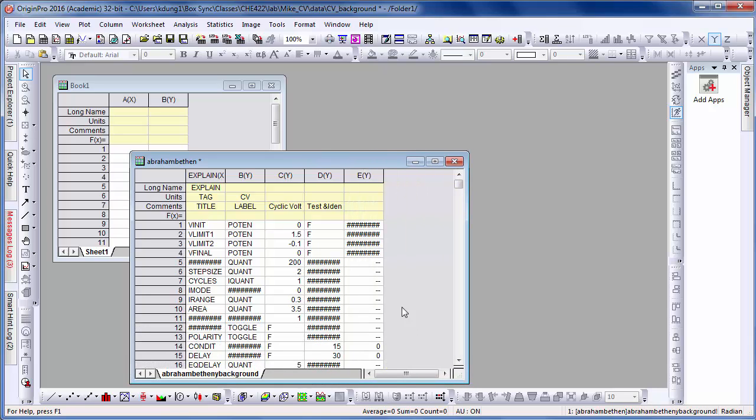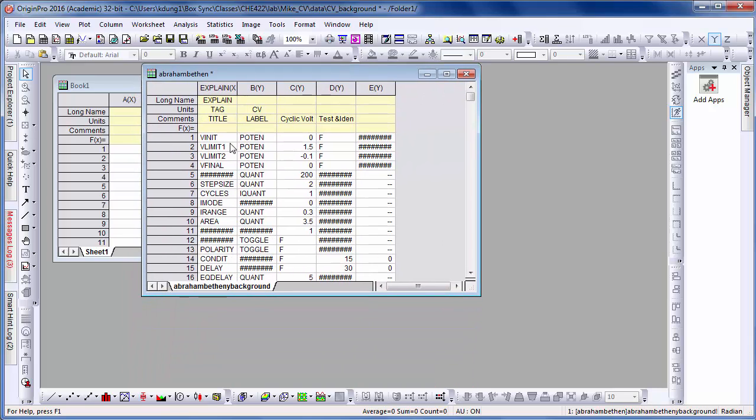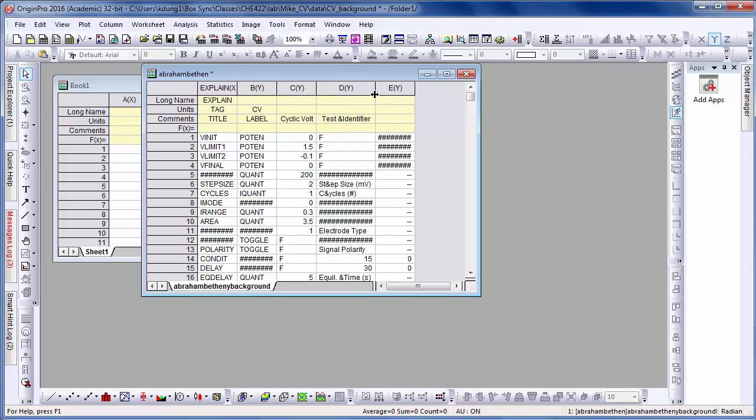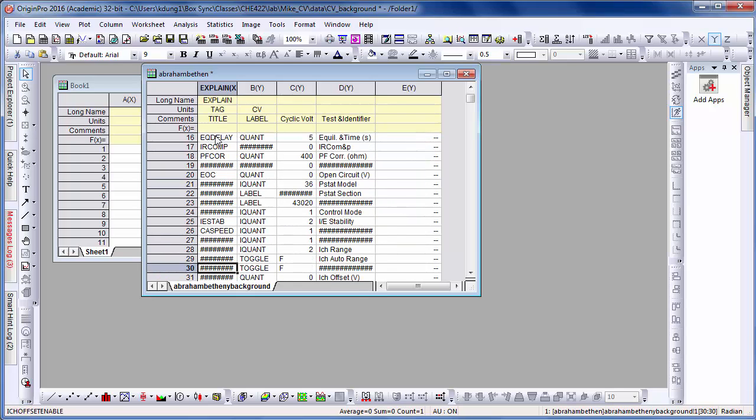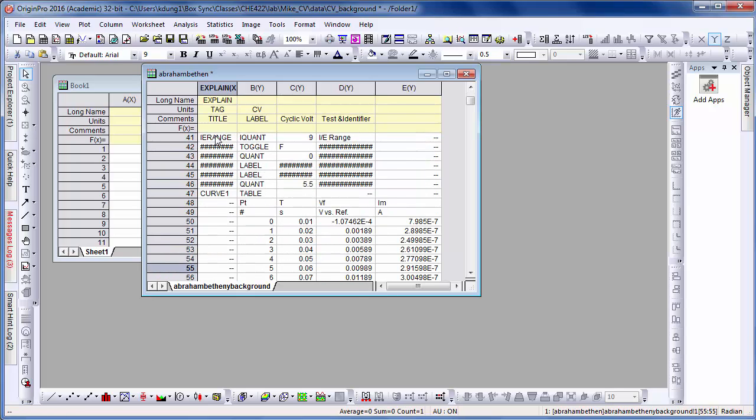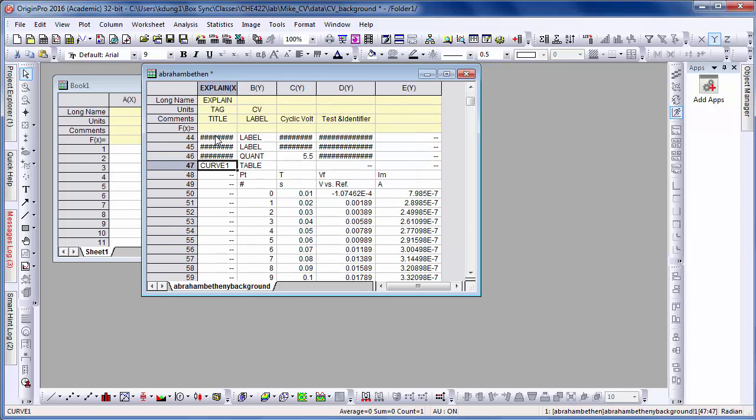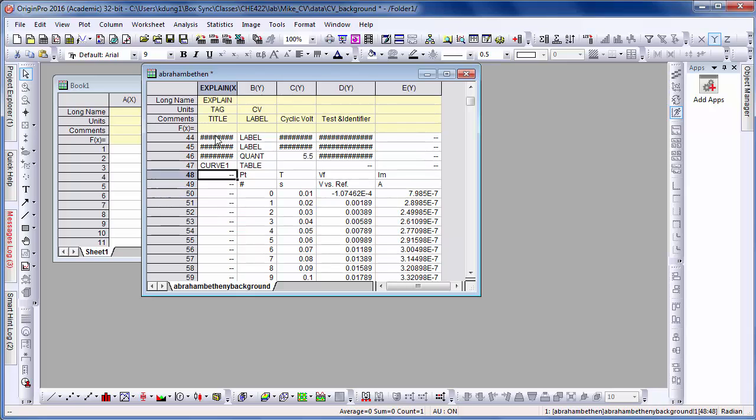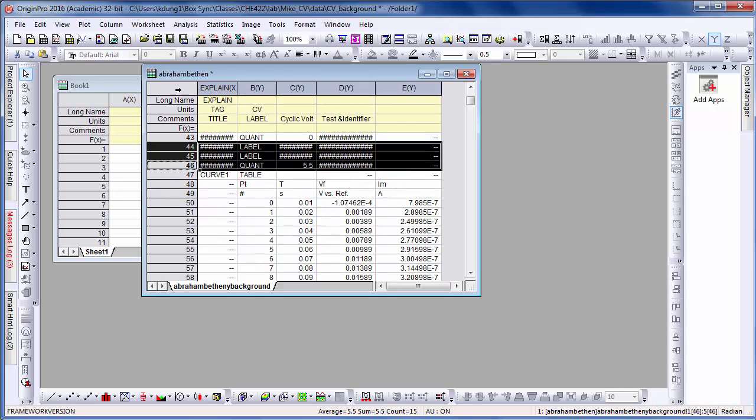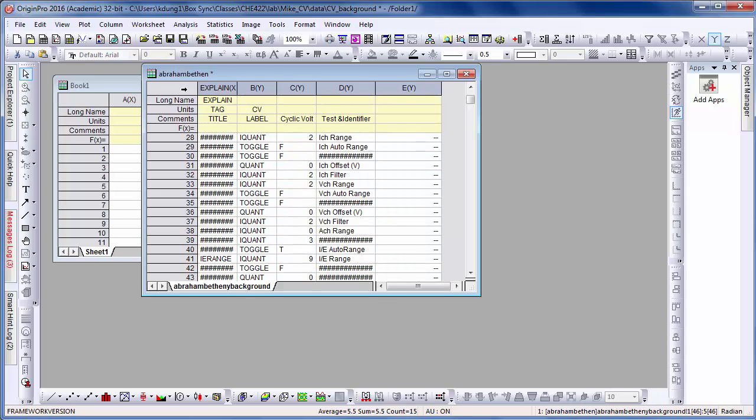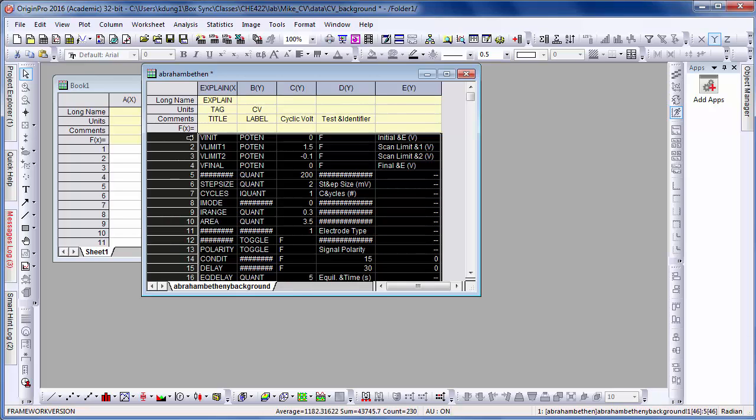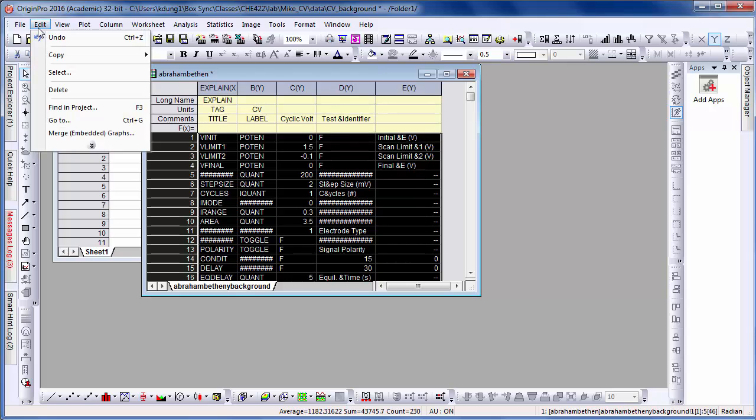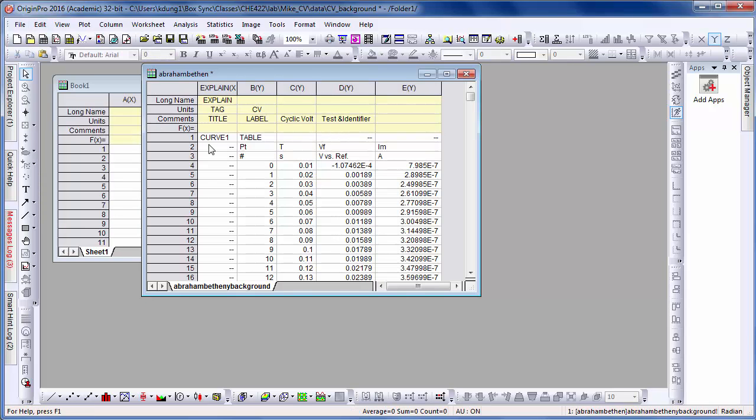You see that on the worksheet there's a bunch of information here at the top. This is called the header information and is telling you how you set up the experiment. We don't need this to make the graph. All the way down here on line 47 is actually the start of the header information for the actual data to be graphed. We can remove all this stuff by highlighting it and then deleting it. Now we can start transferring this header information up into the headers in the worksheet.